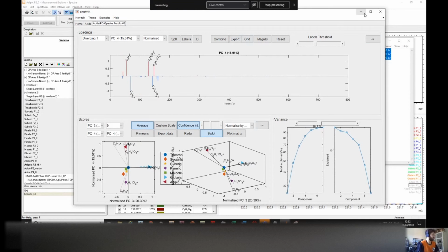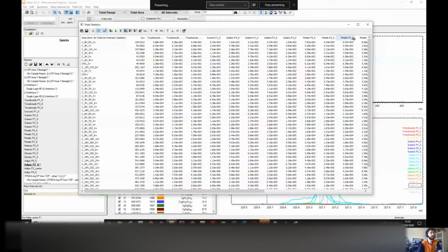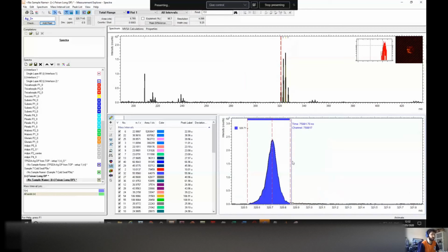Okay, so now let's move on to the depth profile. One level of complexity further down, now you have data that's structured. Each point is spatially related, because they're coming from different depths. For that one, I will use this depth profile for a printed device with several layers.